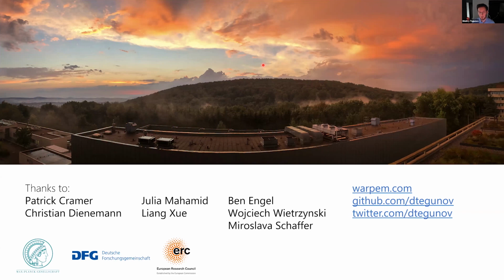And you may have seen a preprint from John Rubinstein's lab a few days ago, where they propose a new file format that lets you fractionate the dose much more finely with Falcon cameras. And for tilt series data, the most significant misalignments are just global translation and rotation. Everything else gives you maybe an extra, I don't know, 10 to 20%.